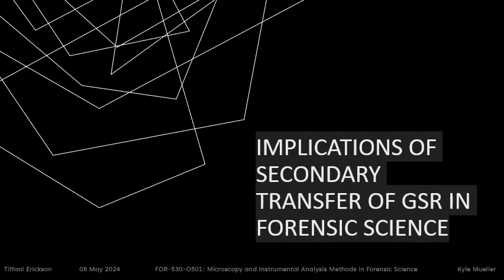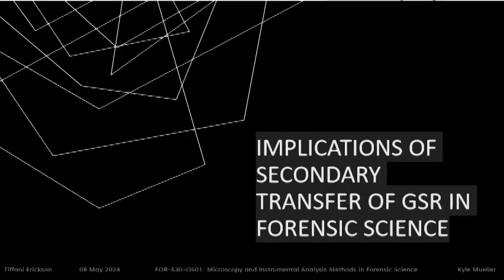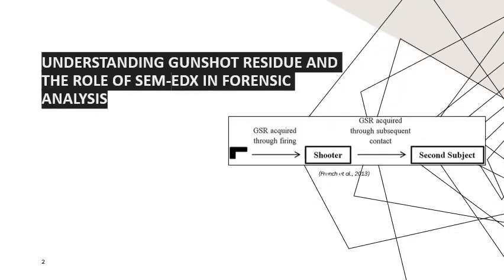The implications of secondary transfer of gunshot residue in forensic science. Understanding gunshot residue and the role of SEM EDX in forensic analysis.